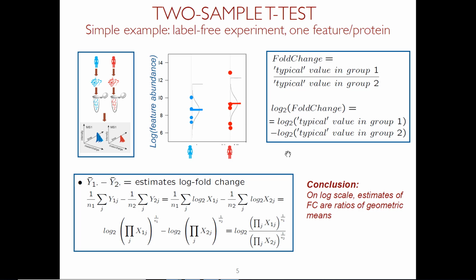And so we looked at pictures like that yesterday where we're interested in differences between the two groups on the log scale. And by the way, we will stay with the goal too, where we compare the averages of protein abundances between the groups. However, this is a question which is often asked: in analytical chemistry, I'm always doing ratios, right? So what does it mean on the log scale, taking averages, comparing them, versus looking at the ratios?